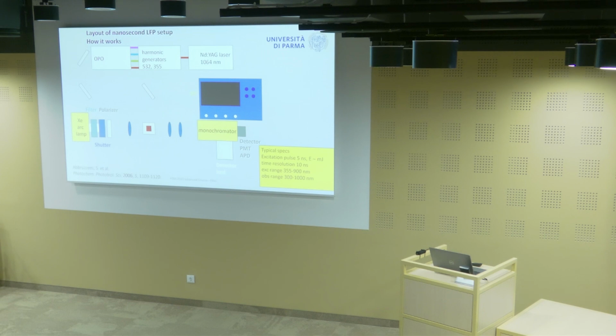If you have to buy a lamp yourself, prefer 75 watts. That's by far the best lamp. It's the smallest arc you can get. My personal opinion as a user.